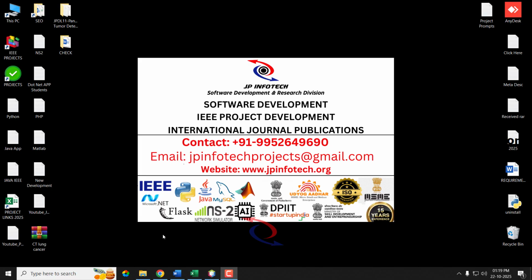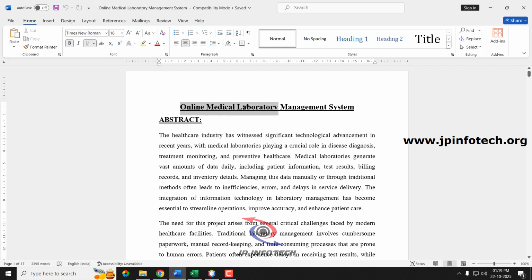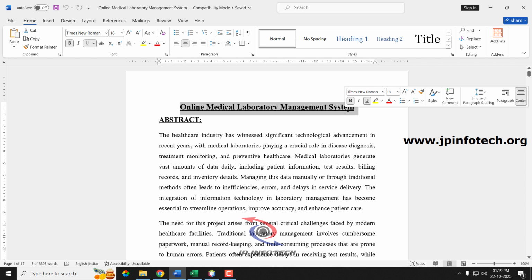Hi, in this video we are going to see a Java web application project entitled Online Medical Laboratory Management System. Before seeing the execution of the project, let me brief about this project.